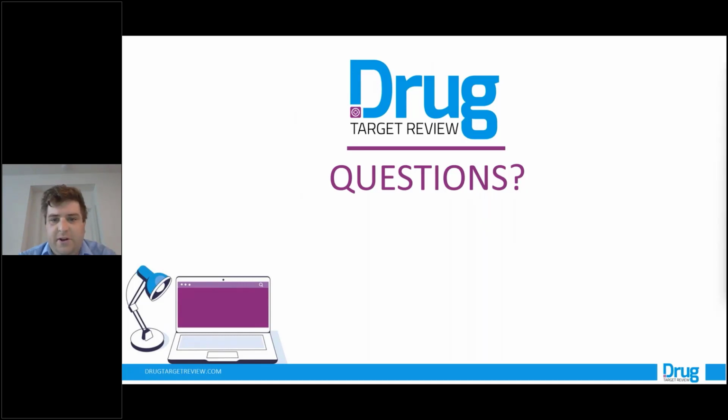What is the turnaround time for custom assay development for this assay? The turnaround time for custom assay development, as described in the presentation, is 4 to 6 weeks for clone generation and assay proof of principle, so to establish the assay window, and then 2 to 4 weeks to do assay optimization, where we determine the correct bait load gradient and the correct top concentration for the dose response of the test competitors that are used in the assay.